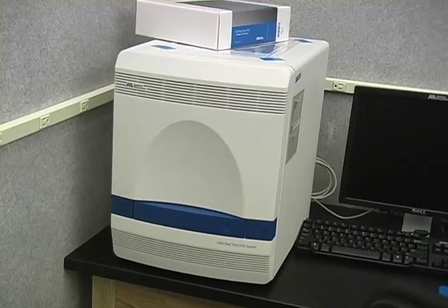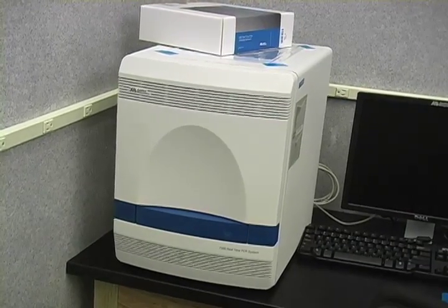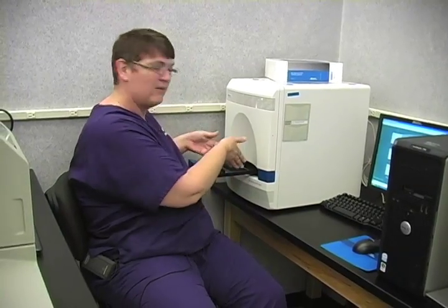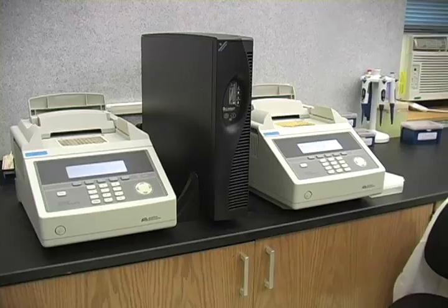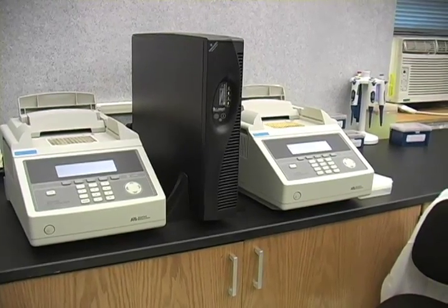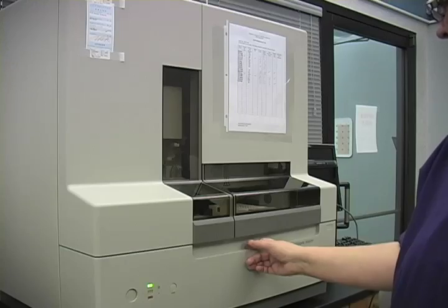The next step of the process is the amplification process. Amplification takes place by PCR or polymerase chain reaction, which allows us to take a very small sample of DNA, add synthetic DNA pieces and other chemicals. We then put it into this instrument here, and it can actually make identical copies of the DNA that was originally in the sample, allowing us to use a small amount of sample and get a DNA profile.